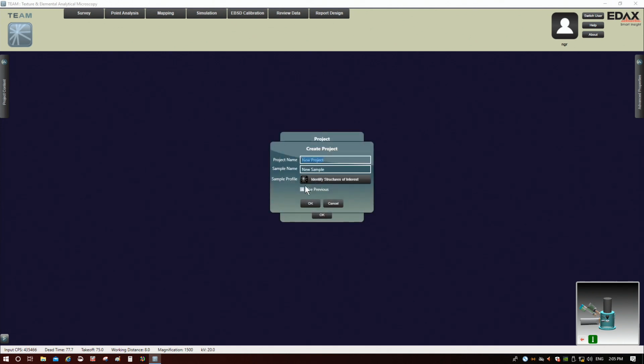So create a new project. All right, so project name. We'll call this project YouTube tutorials. Sample Inconel 600. We'll call it YouTube EBSD tutorial. Okay. All right.